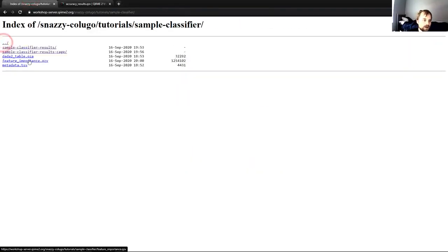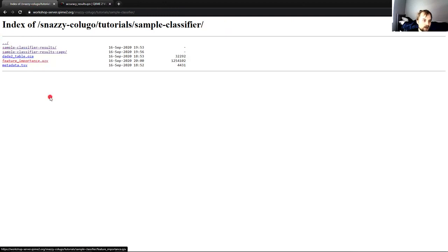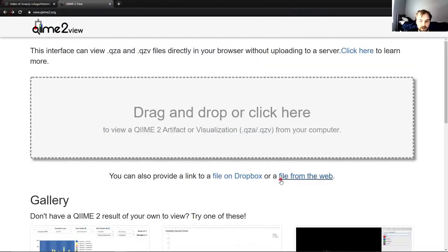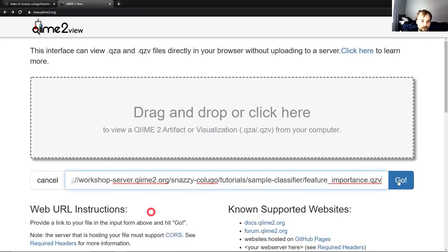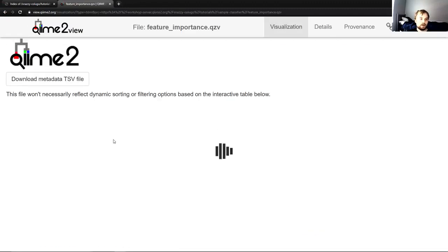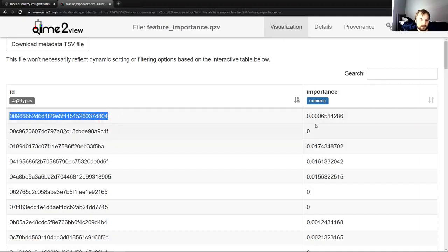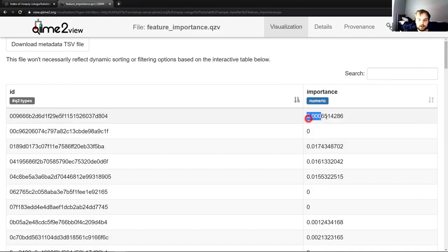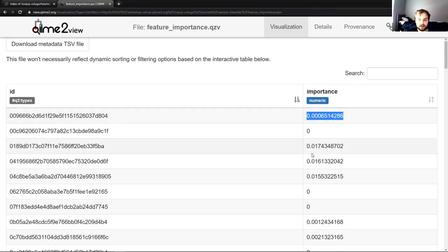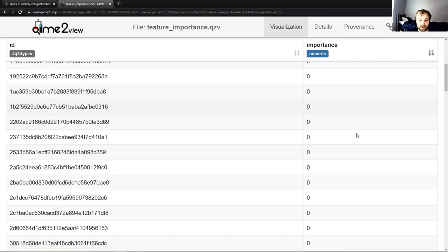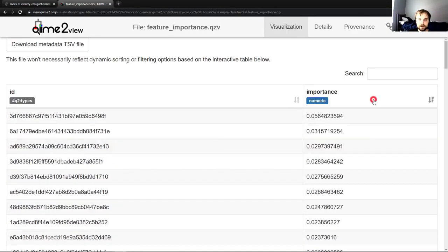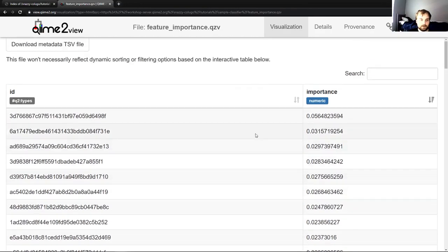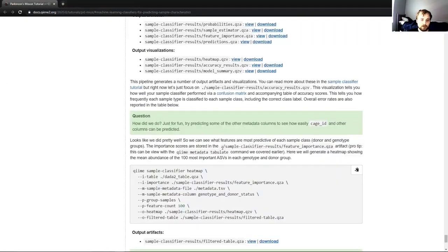We will run this and here we have our visualization feature importance QZV. And if we go view that, copy link address, I'll just go back to this window I'm already in. Back, file from the web, paste. We have our IDs and the importance of that feature ID for predicting, in this case it was the genotype and susceptibility of the mouse. So if we sort by importance, we can see a lot of them not important at all and a spattering of importance through here. So moving back to the tutorial, we're going to run one more command.